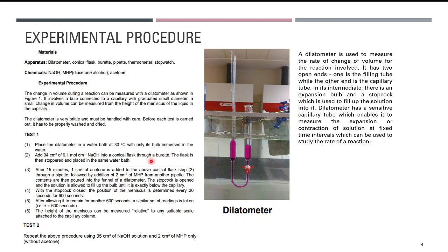So you do that without first. Okay, so you will monitor the reading for 10 minutes, and after that you rest for 10 minutes and then continue for another 10 minutes.